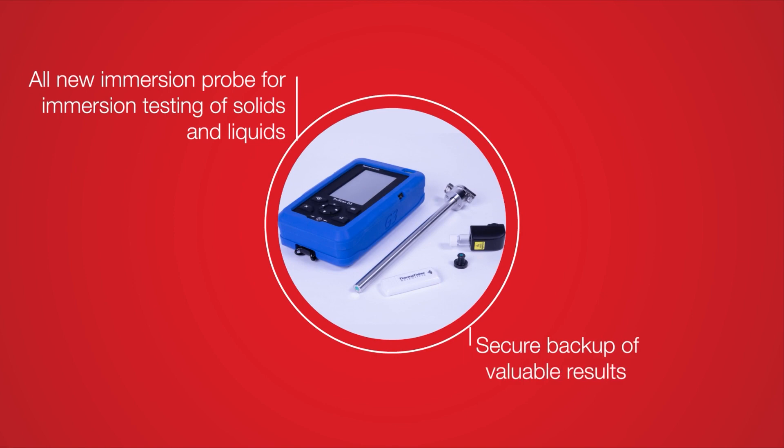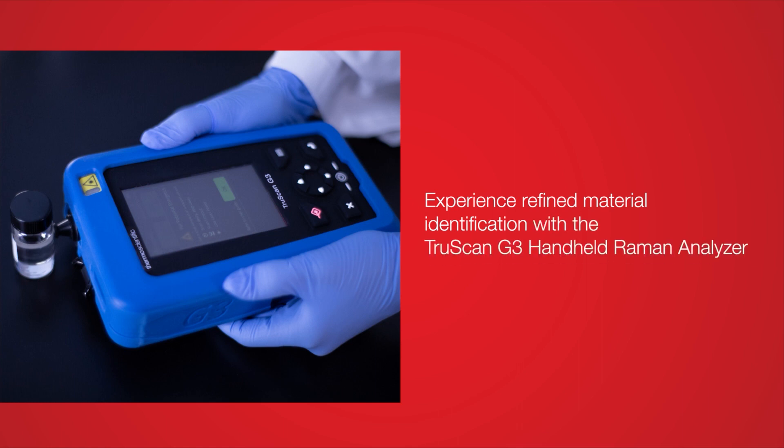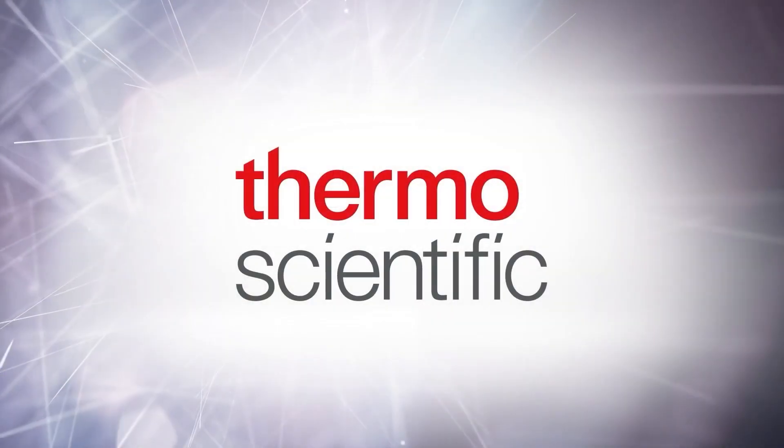Its versatile accessories and easy method transferability equip your teams for verifying materials throughout production. Experience reliable material identification at the point of need, minimizing the need for costly and time-consuming laboratory sampling tests with the TruScan G3 handheld Raman analyzer.